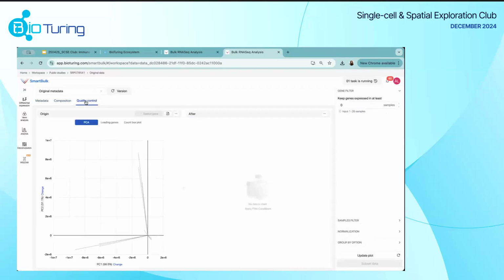And the really important step is being able to go back and see if the original data set actually had these control steps in place. So did they have any QC parameters? Were any samples with low quality transcripts removed from the data set, to be able to make more concrete inferences from the results? When we go into the study, you'll normally have the original PCA. So this currently is the data set without any QC or any normalization or filtering.